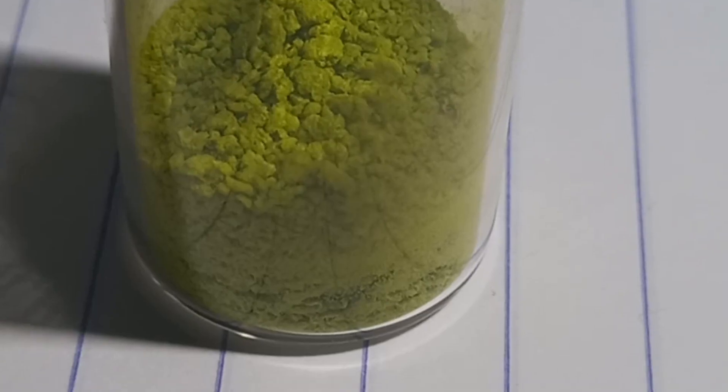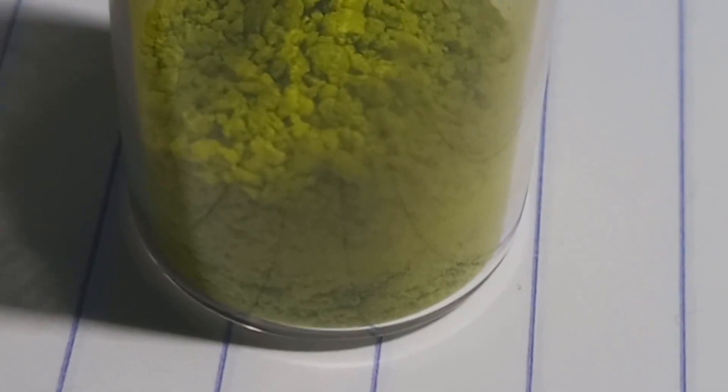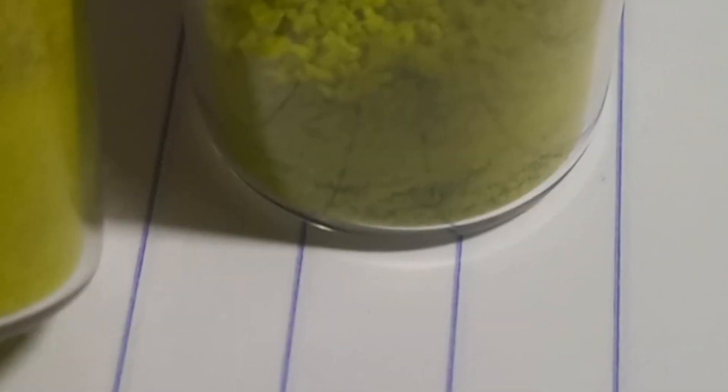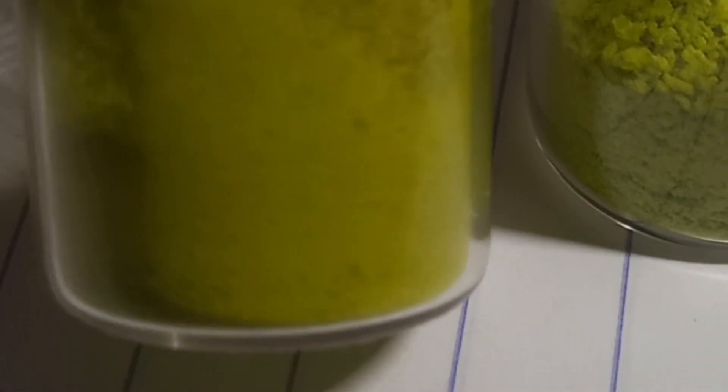The alanine tetrachlorocuprate is already crystallizing — that's pretty epic. Here's the final product. It looks very similar to the glycine tetrachlorocuprate, only a little bit more green. The camera has a hard time picking it up, but this one is slightly more yellow.